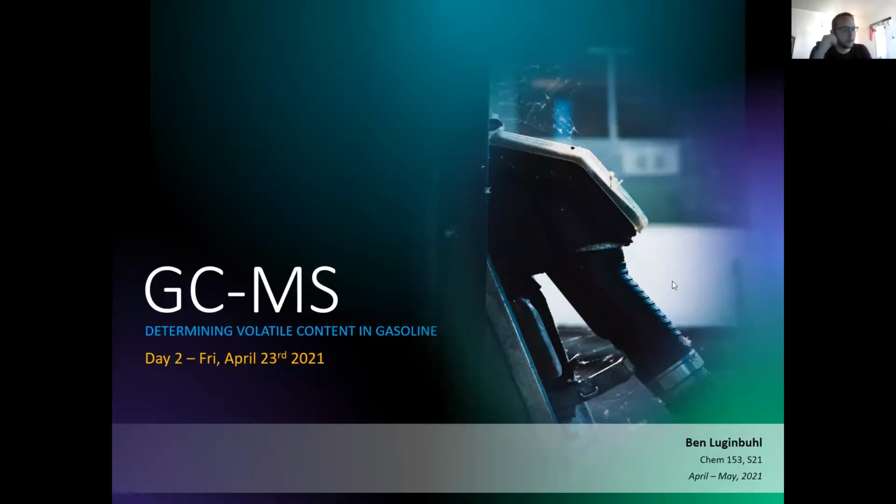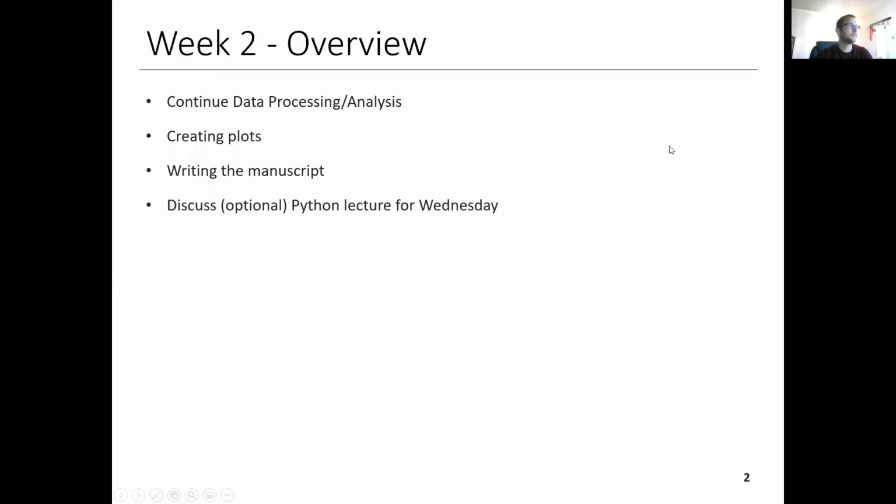So this week will hopefully be a little bit shorter than last week. We're just going to go over any questions you guys have about the data processing and analysis, and I'll go a little bit into more detail about the format of the actual lab report itself. And then at the end, we'll talk a little bit about the Python stuff and just kind of gauge who all is actually interested in that. So let's launch right in.